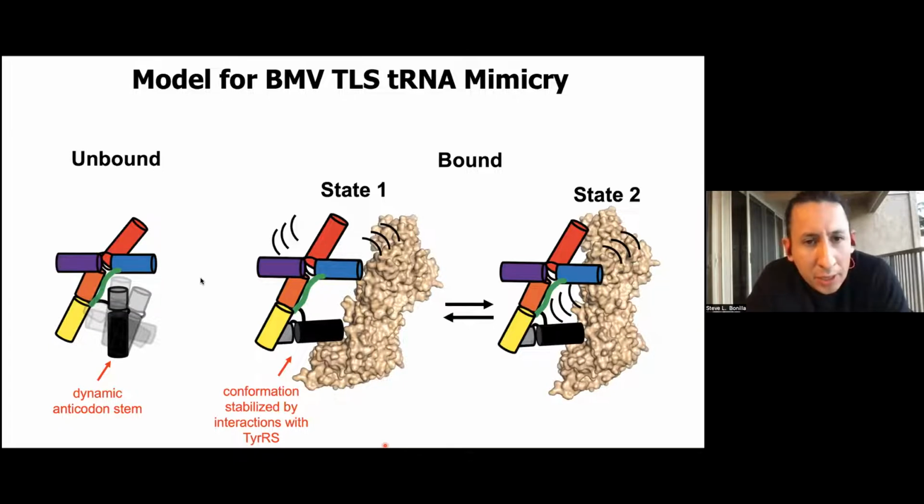How will I go about increasing the TLS resolution? I don't know. I'm not completely sure, but getting more particles, and doing larger or more extensive classification, could potentially result in higher resolution. I think that maybe getting more data and trying newer versions of classification could potentially lead to high resolution.